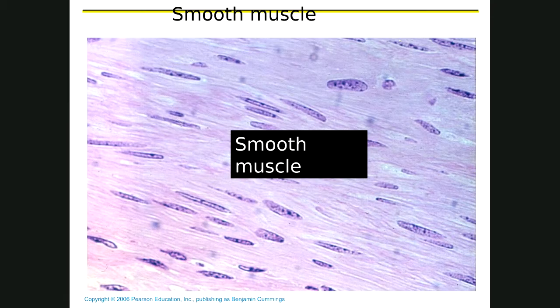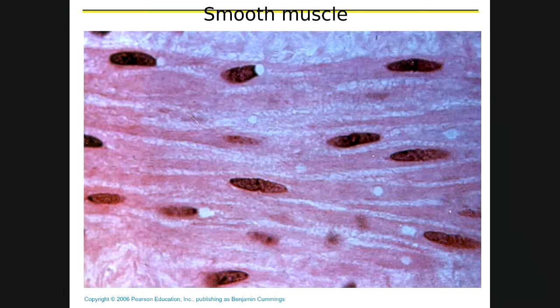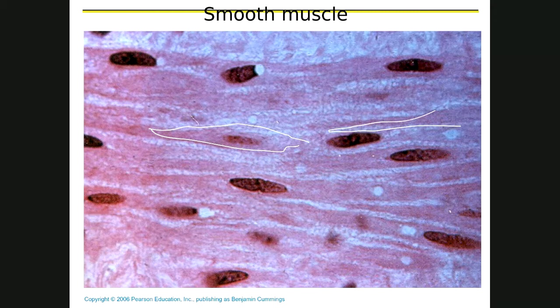Here's what it looks like blown up a little bit — you can see the tapered ends. Look at that one: tapered ends there and fat in the middle. There's a tapered end right there and fat in the middle. Same thing here and so on. This is smooth muscle, and look — there are no stripes, no striations.